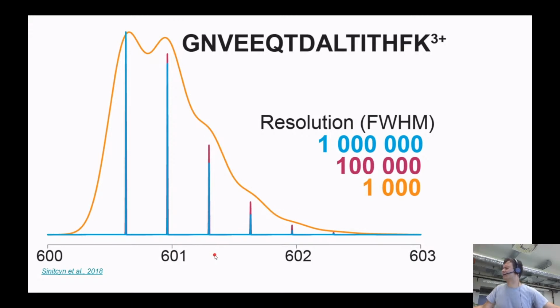Actually, sorry, maybe that's very important to describe. So what's the distance between different peaks? If you look closely, let's say this peak is happening on 601, and the third peak is happening on 602. By that, you can conclude this distance between peaks is 0.33333.